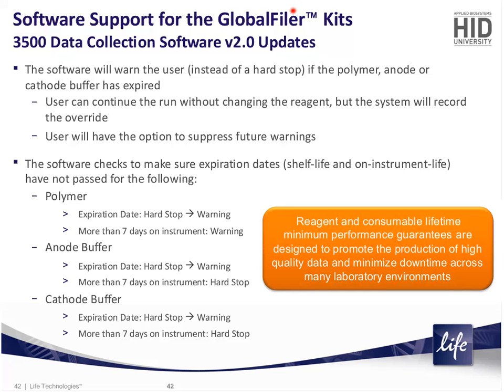We obviously produce reagent and consumable lifetime minimum performance guarantees, and those are designed to promote the production of high-quality data and minimize downtime across many different laboratory environments, bearing in mind that some instruments may be in very cold environments, other instruments may be in very warm environments, and we have published information on why we made the original decision to introduce these limits in the first place. So, of course, we would advise caution to laboratories wishing to go beyond these limits, but we do appreciate that some additional flexibility may be required.